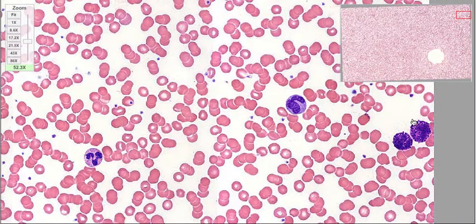This is one here. They make up about 1% of the blood, so they're very, very rare. You'll be lucky to find them in a blood smear. But essentially, basophils, you can't go by them. They're very heavily granulated, so they have a lot of histamine jam-packed into the cell. As you can see here, you can actually make out individual granules within the cell. So that's what gives them away.